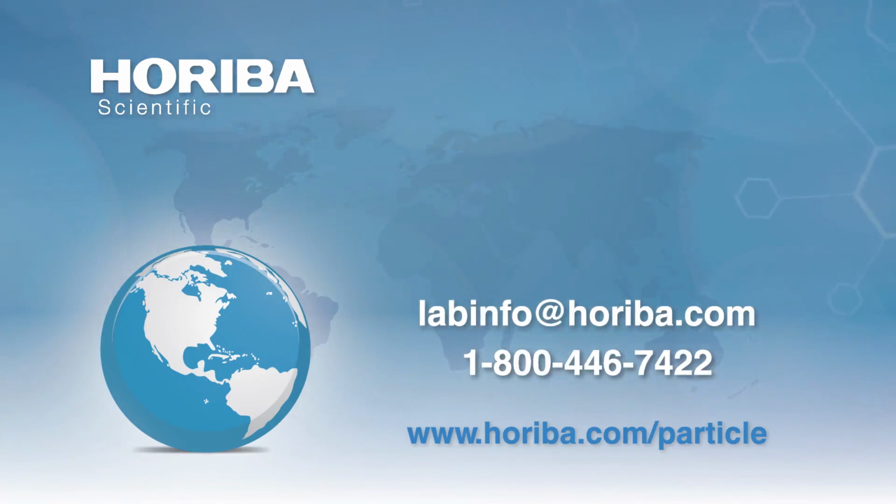The reason we go to low concentrations is so the particles are distinct when we're trying to do tracking, because we don't want the particles to cross, since then we never figure out who comes out the other side. So if we can find a system with very long-range interactions, there are some games you might be able to play with the tracks. And if you want to track things like nucleation phenomena, this is a great tool and a big step above current approaches, which just rely on total scattering. So good question. Thanks. I hope I helped.